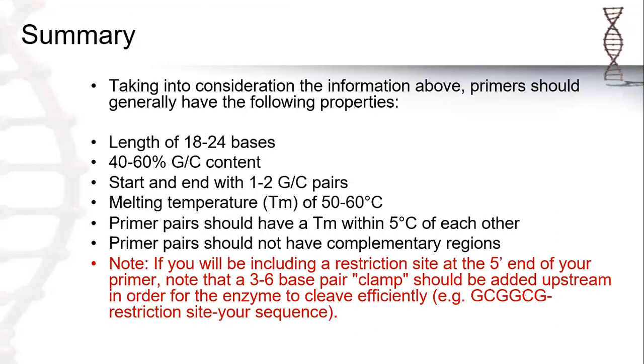At the end of the lecture, we have summarized some guidelines and tricks that we have to remember for designing the primers. If we don't have the software, you have to know about these properties, and by knowing these properties you can design the primers without the help of any tools or software, by only drawing in your notebook.